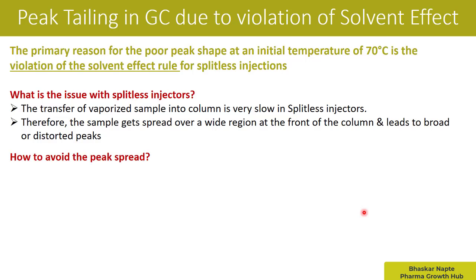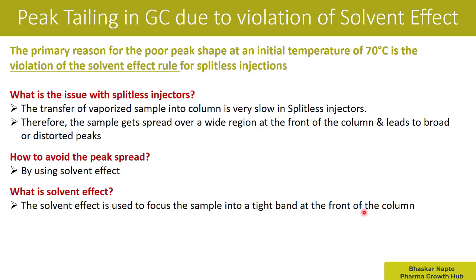How do we avoid peak spreading? As explained, the peak can spread in splitless mode, and since it is sometimes necessary to use splitless mode, the answer is to use the solvent effect. I will further explain what the solvent effect is and how it occurs. The solvent effect is used to focus the sample into a tight band at the front of the column.